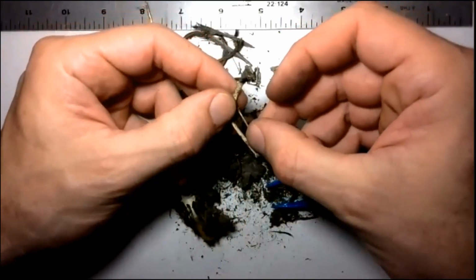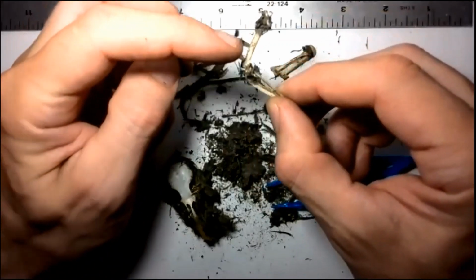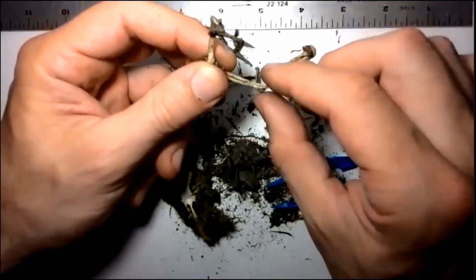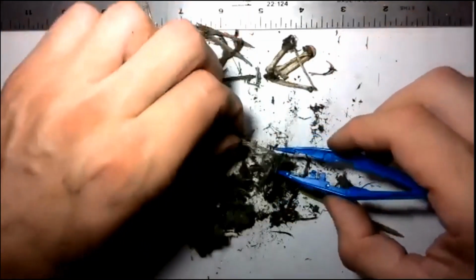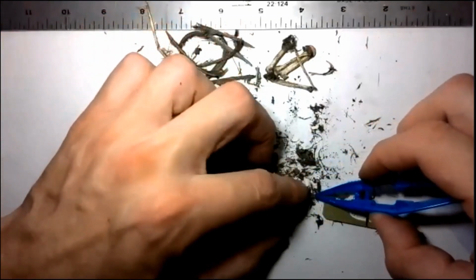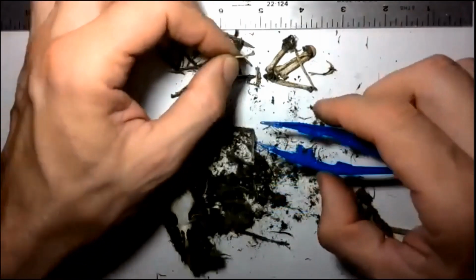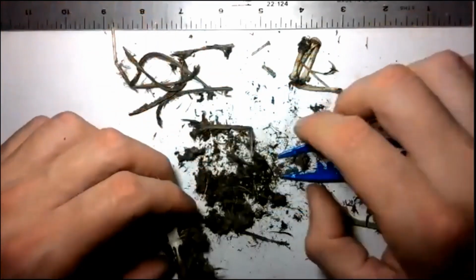fibula. See, this is the lower leg, and this is the knee, and this is the thigh, the femur that goes attached. So this is almost the entire leg of the bird. All right, and we keep finding feathers, more feathers. I don't know this particular one here. I think it's a small rib. So we have almost an entire leg.